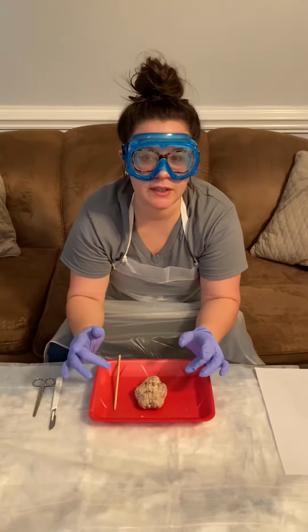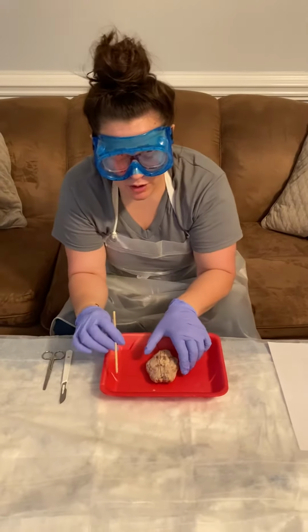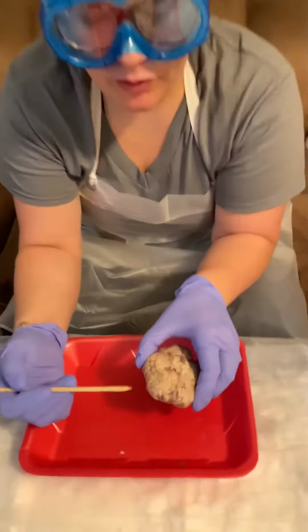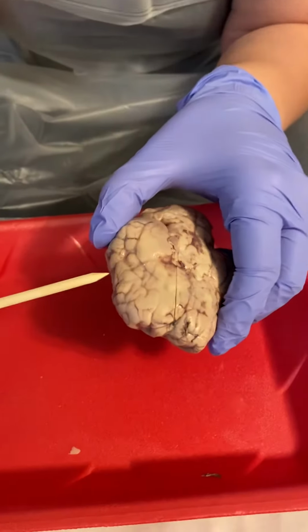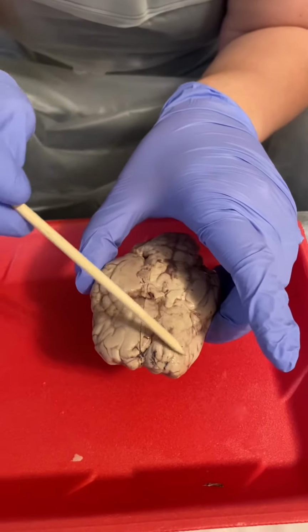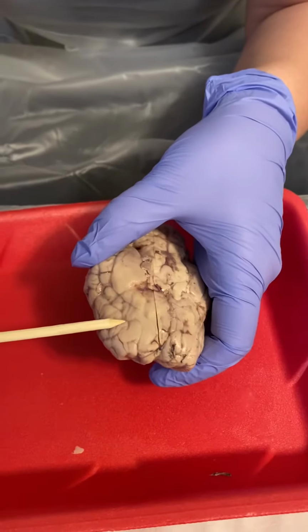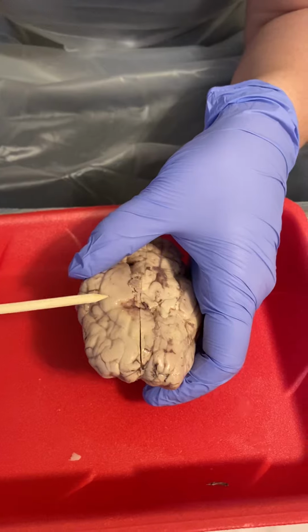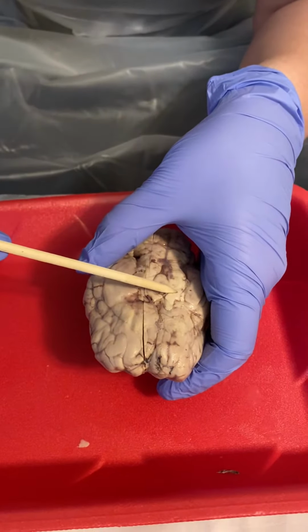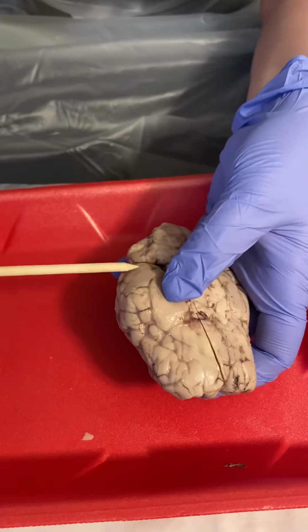Hey guys, today I'm going to be naming 15 different parts of the sheep brain. So to start off with, we have your right cerebral hemisphere, and then your left cerebral hemisphere. This is your frontal lobe, your right parietal lobe, left parietal lobe, temporal lobe, and then your occipital lobe.